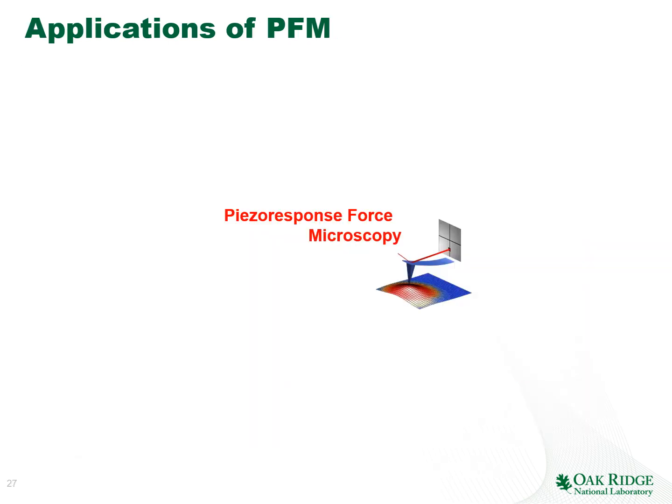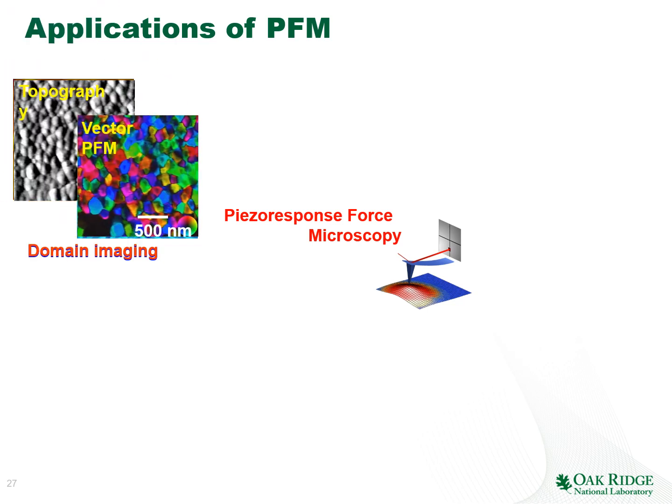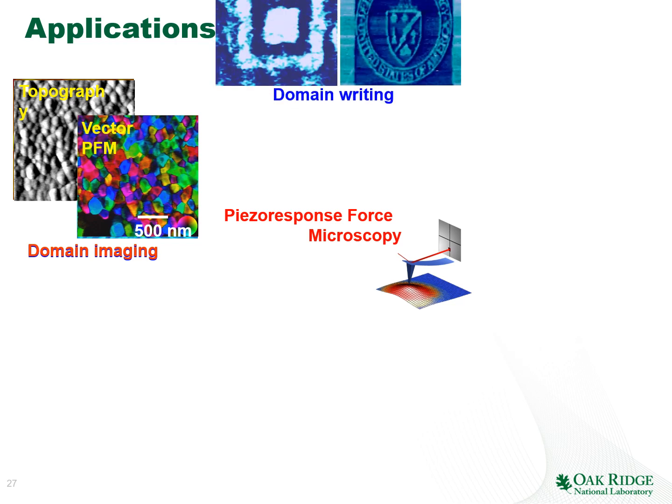Now, what are the applications of PFM? It turns out that in the 25 plus years that PFM has existed, it has found application in an extremely broad range of materials problems related to ferroelectrics, energy materials, biosystems, and so on and so forth. One of these applications is imaging domains. We can get topography images of the material, and we can get beautiful images of the domain structures. And of course, we can also get vector PFM images.